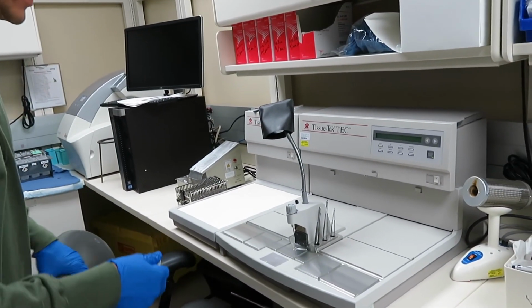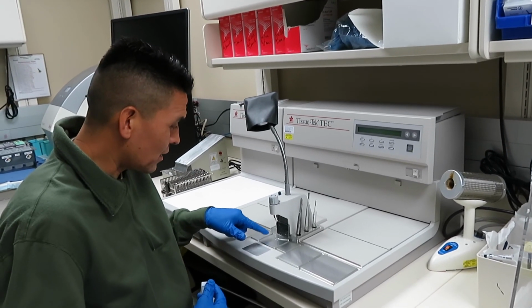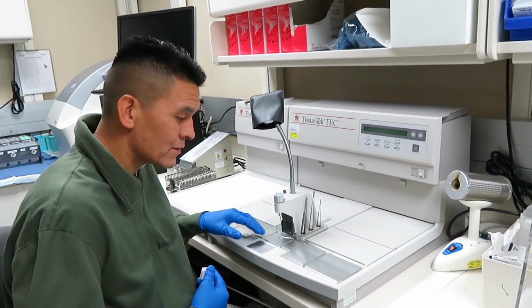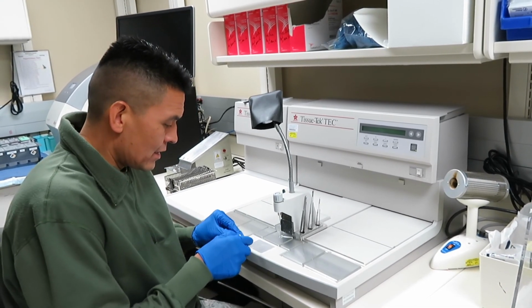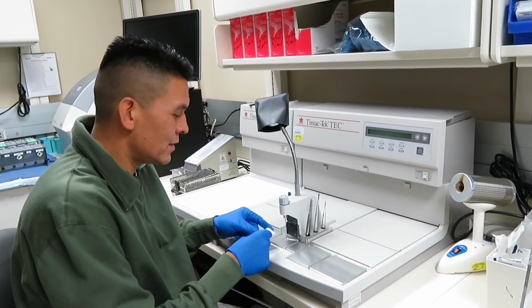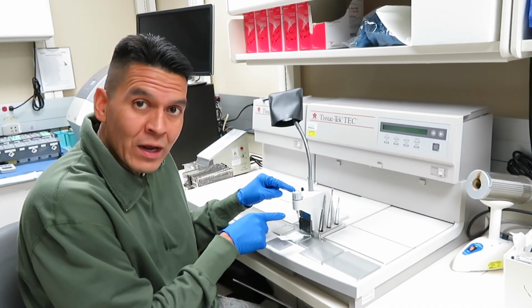And what they do is they sit here. This is heated, this little platform here. And what they do is they get the tissue and they put it in, wax comes out of here, kind of liquid wax.